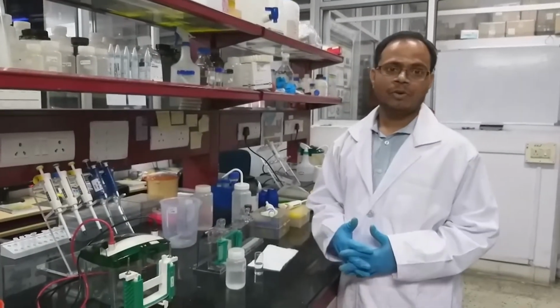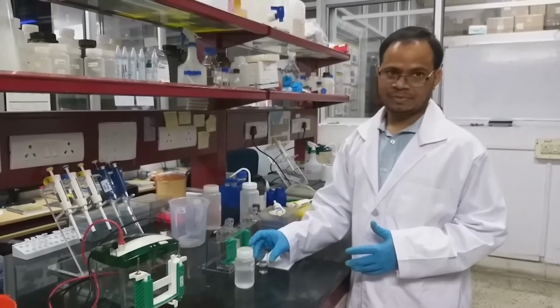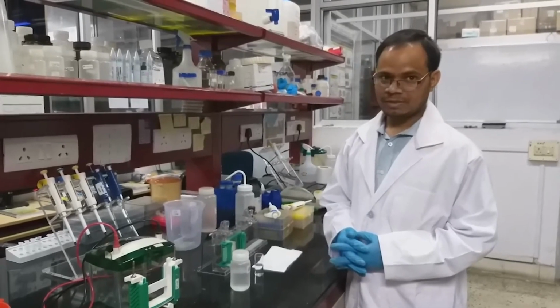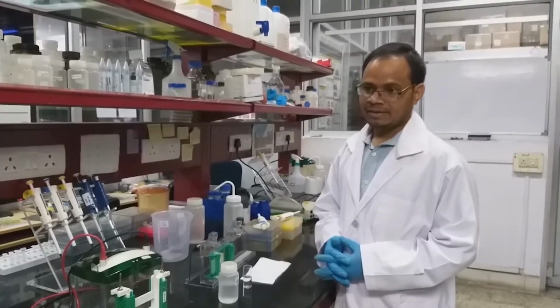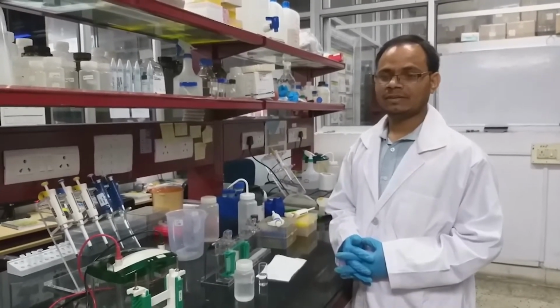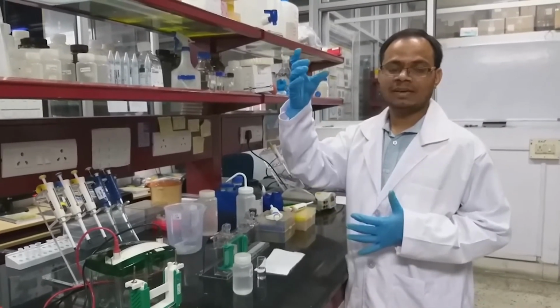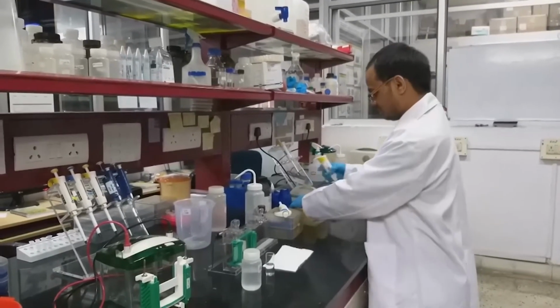We have to add 100 microliter of SDS to the resolving gel. It plays a very crucial role in polyacrylamide gel electrophoresis. It imparts negative charge on the polypeptide chain, so that despite their charge, they will move based on the molecular weight. So I am going to add SDS.